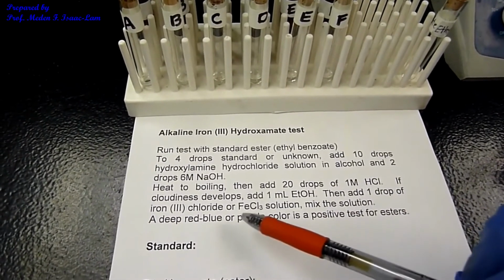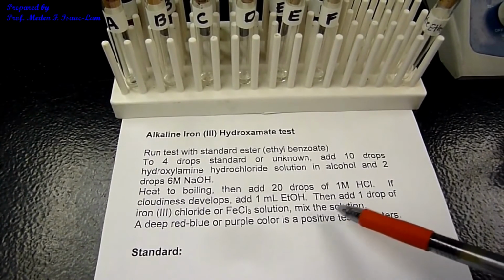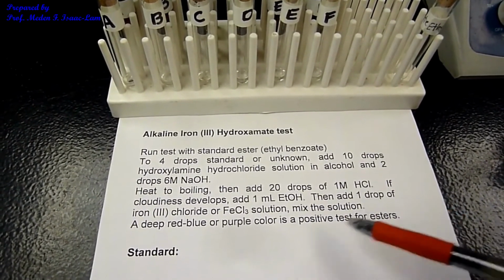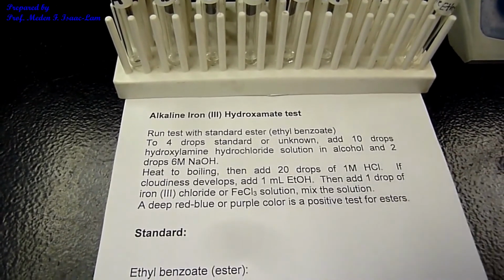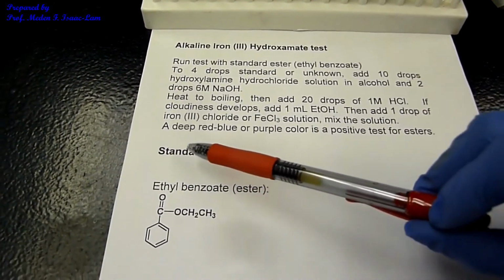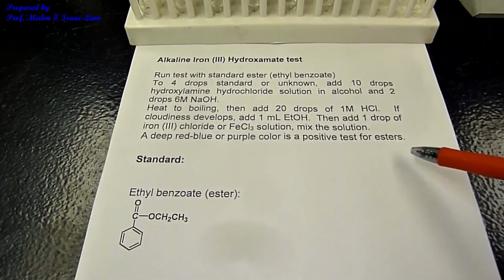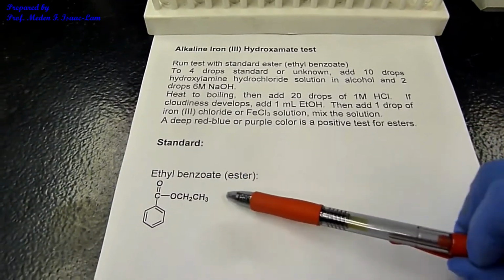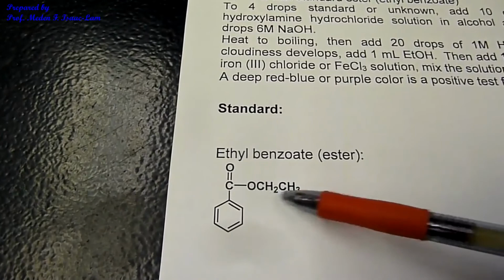If cloudiness develops, we are going to add 1 mL ethanol, then add 1 drop of iron(III) chloride or FeCl3 solution. Mix it, and if there is a red, blue, or purple color, it's a positive test for esters. So the structure of ethyl benzoate is shown in here. There's a benzene and then C double bond O ethyl.